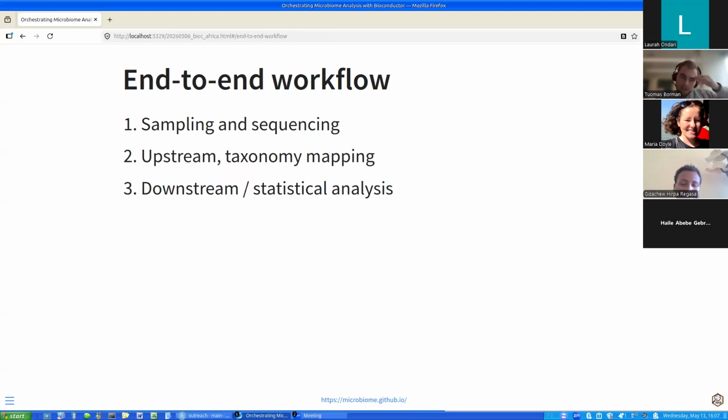Then I forgot to mention that some of you asked about the MicrobiomeExperiment, and was it the MicroTable? I believe it was the name of the class, and some of you asked if that was a data container, and it is. I checked, so that is very correct. But as I said, we are here focusing more on this TreeSummarizedExperiment because that allows us to also do metabolomics and proteomics and genomics, because that's a general purpose data container.